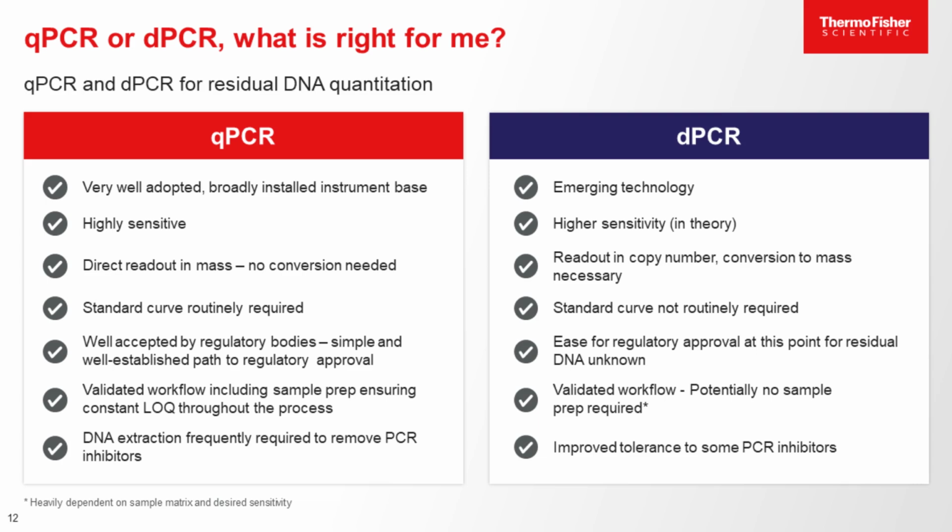But maybe we'll get there. From a qPCR standpoint, we already have a very high sensitivity, especially with excellent assays. Digital PCR, in theory, has a higher sensitivity, for instance, if you're targeting the same single region target. But again, that goes back to the conversation from earlier on if you have a single region target versus a highly abundant, very representative target. So you're losing, obviously, sensitivity there.